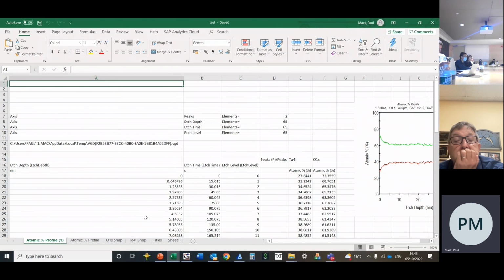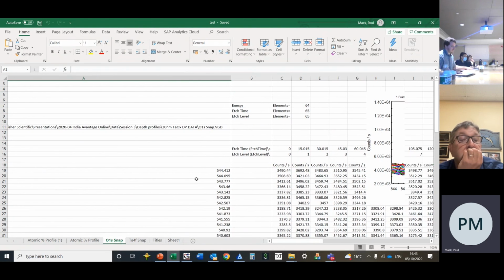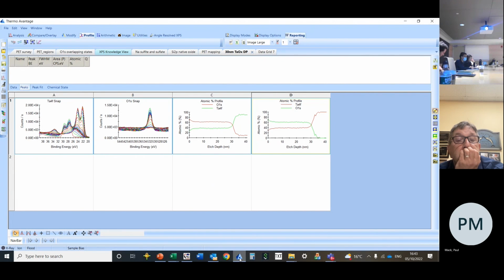So then you have the profile, the raw data itself, that sort of thing. Is that what you mean? That's exactly what I mean. Thank you.